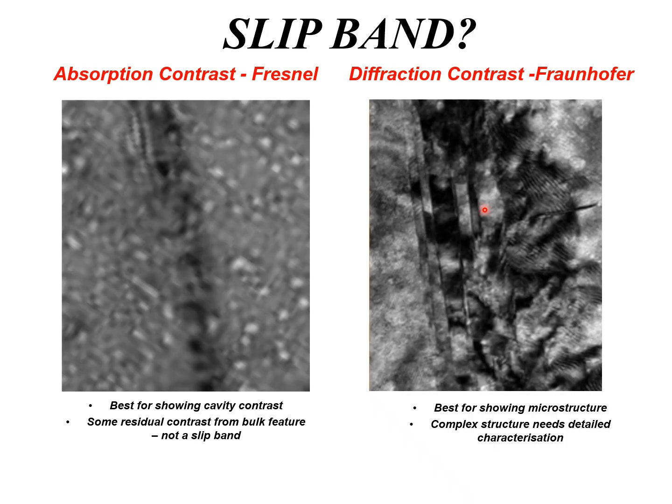Well, it could be something else, basically eta phase. So in nickel alloys, you have what's called eta phase. Eta phase is a fully transformed state of what would be the gamma prime, so it's Ni3Al. But what you would have when you have platelets of eta phase is you basically would have the chemistry signature. And I'm not aware that there is a chemistry signature related to this. So that's the one thing.